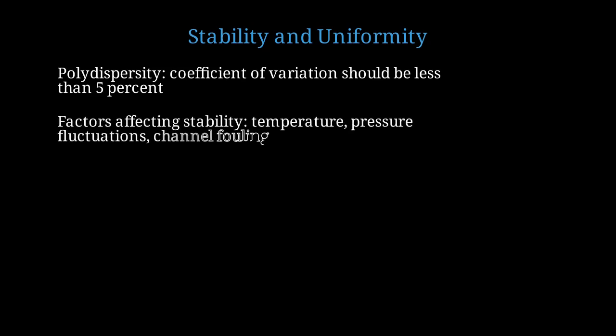Many factors affect stability. Temperature changes alter viscosity and interfacial tension. Pressure fluctuations from pumps cause frequency variations. Channel fouling from particles or adsorption changes the geometry.